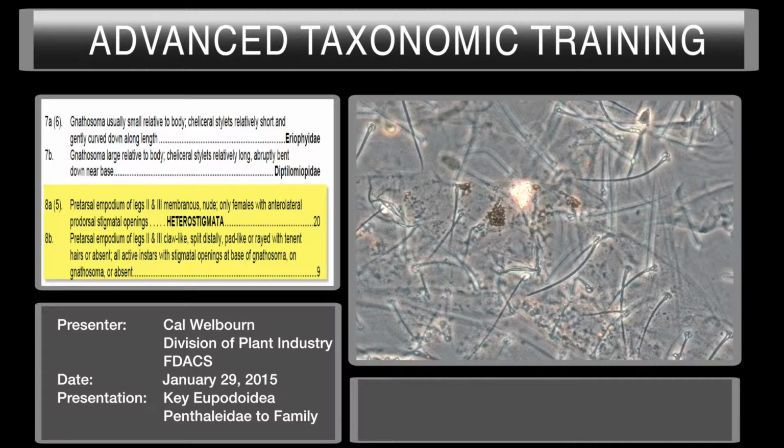But in this view, we have one prodorsal trichobothria, and there's the other one. Usually the seta coming out of the trichobothria, if it isn't globose and obvious, it's very long and filiform, and it'll usually be longer than the surrounding cuticle or different morphology from the surrounding cuticle. So here's your prodorsal trichobothria.